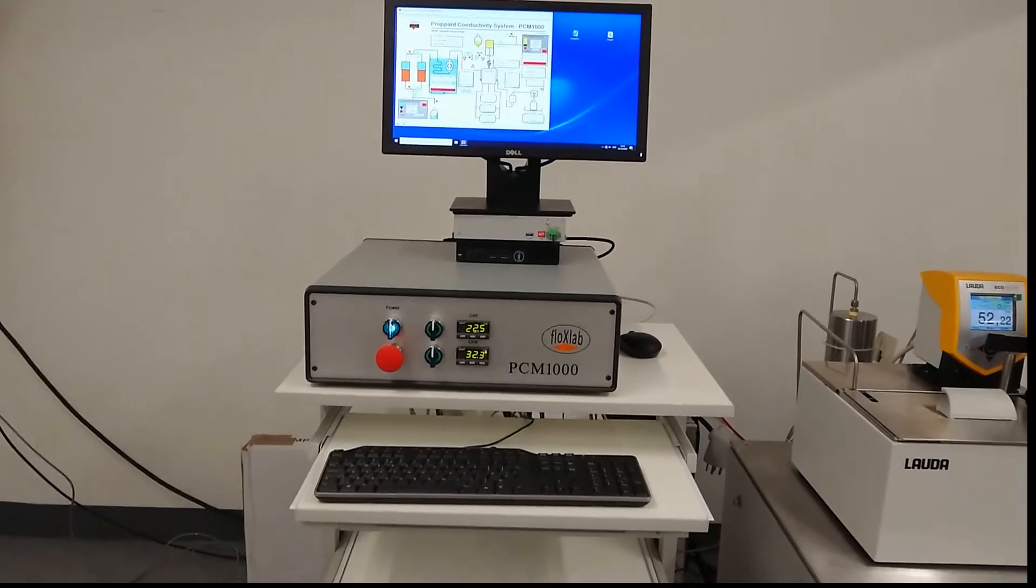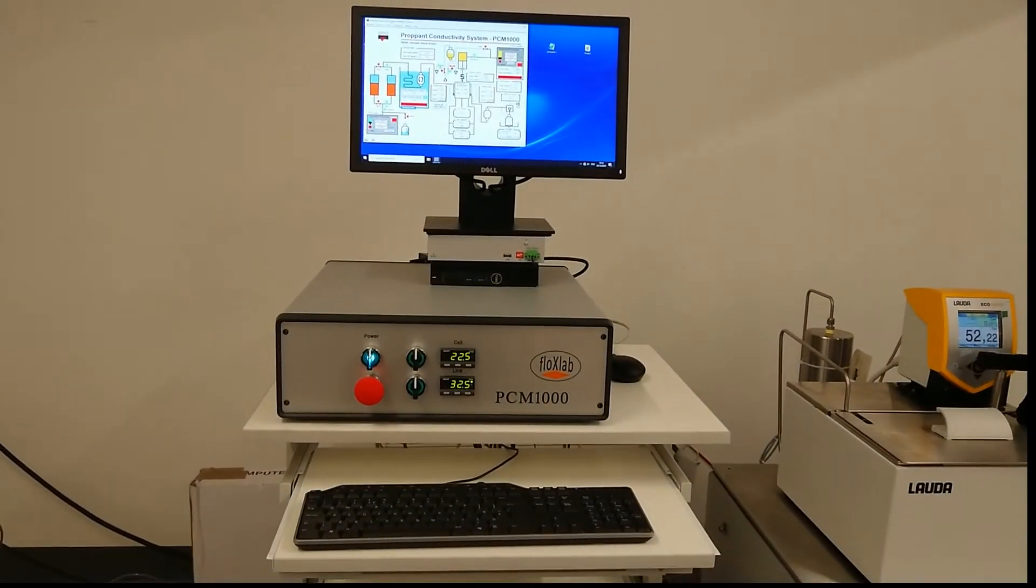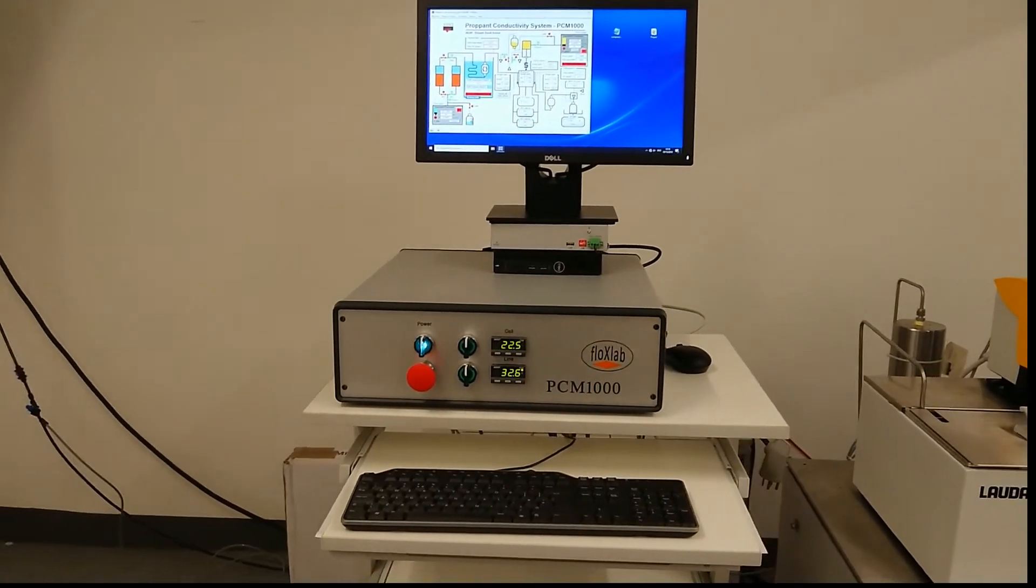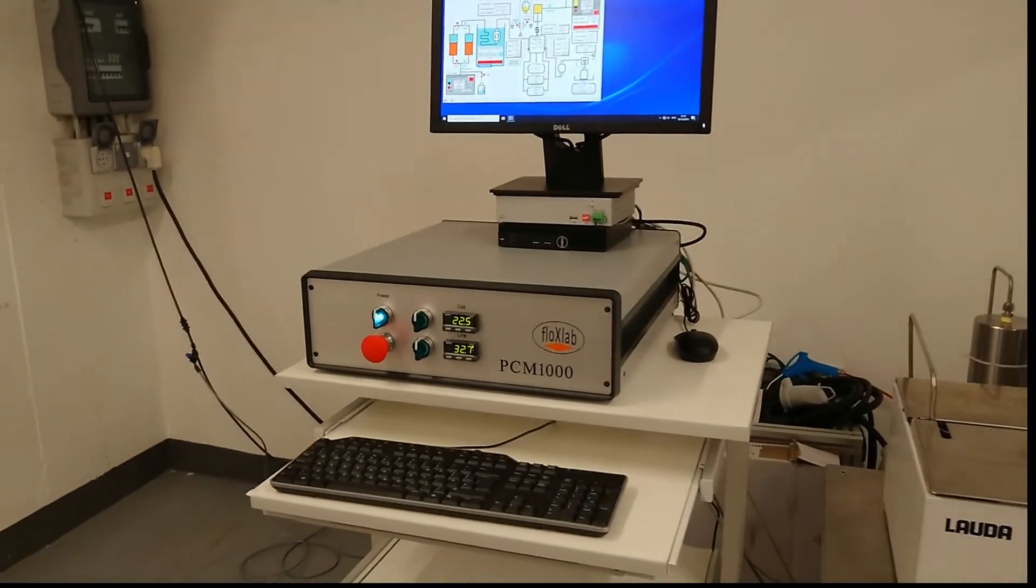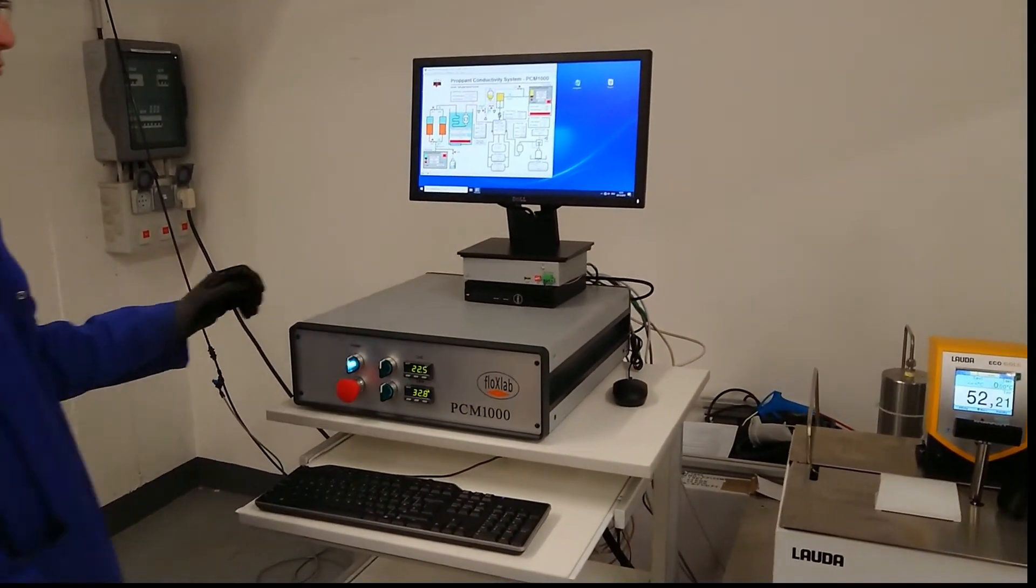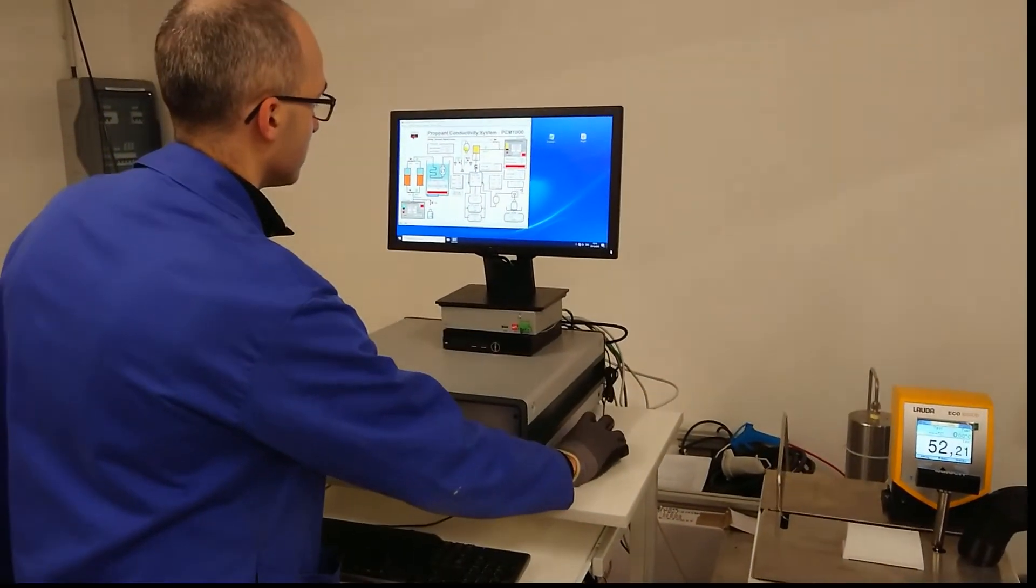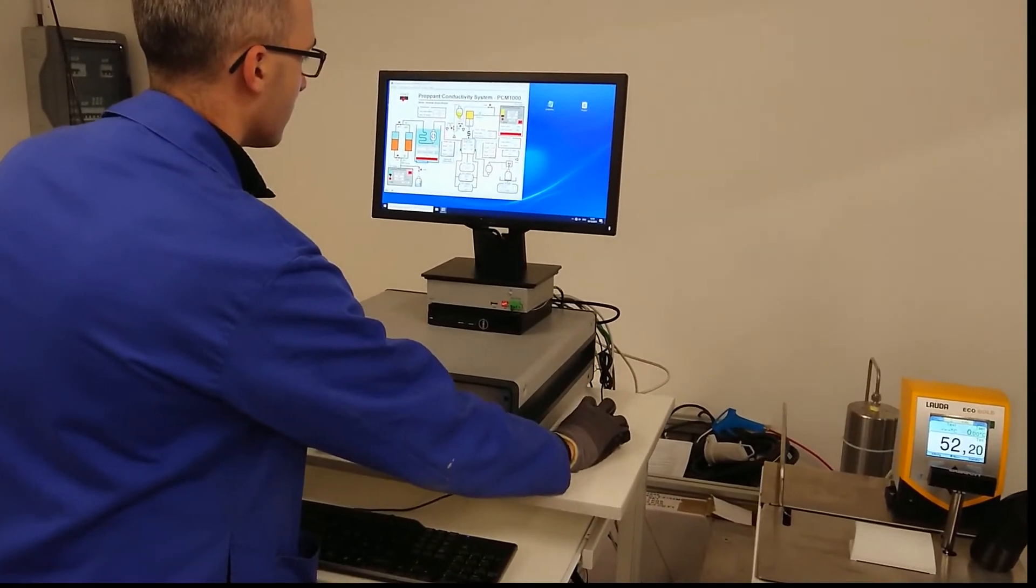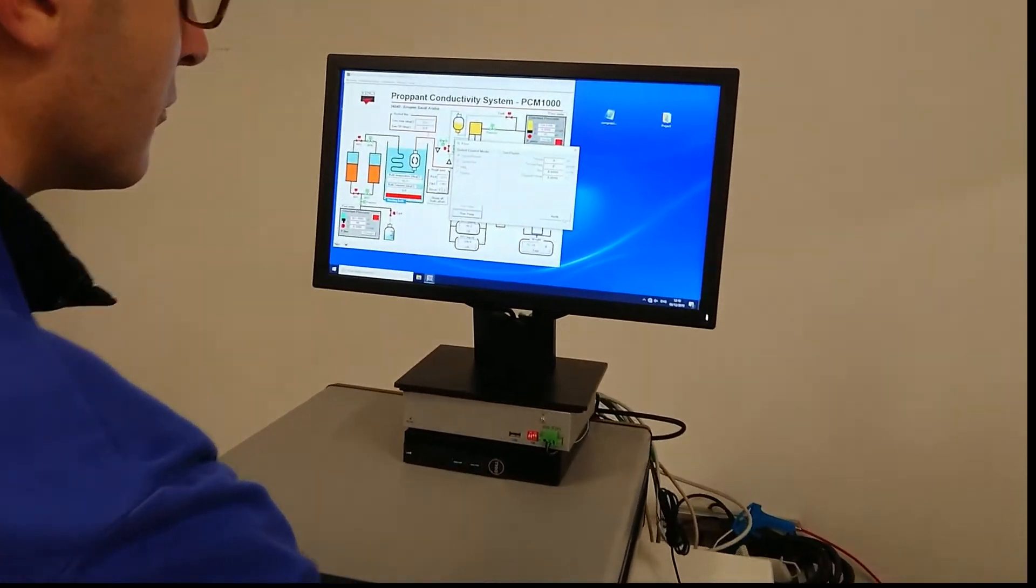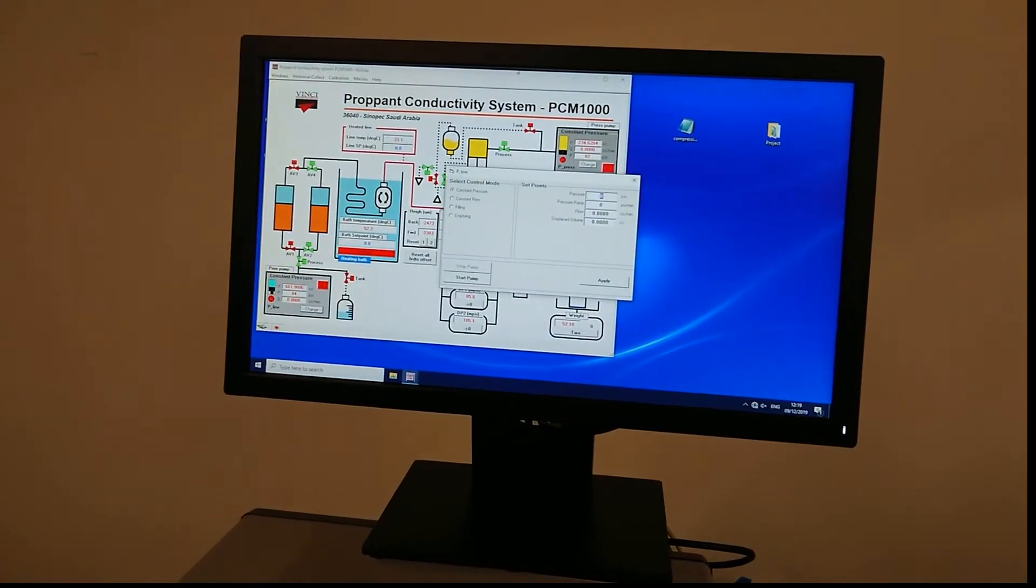The computer control station guides the user through a series of predetermined steps to conduct the test. It also provides predefined templates for fast and accurate test execution, calculates and graphically displays test results, and produces a complete professional test report.